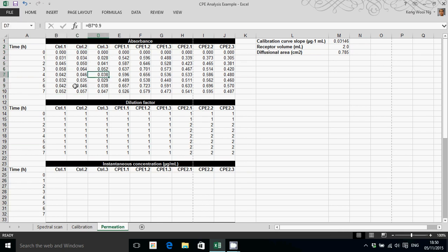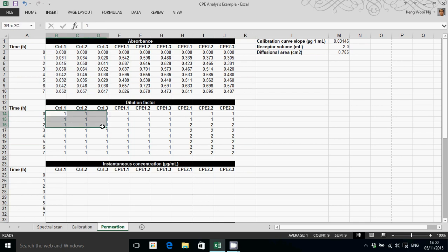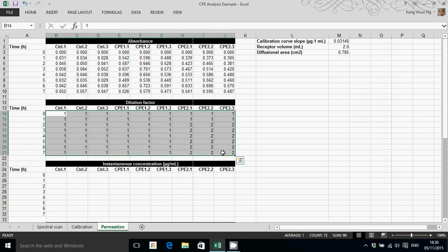Apart from absorbance data, I also have dilution factor information entered into this spreadsheet. That dilution factor relates to whether a particular sample has been diluted for the absorbance reading or not.